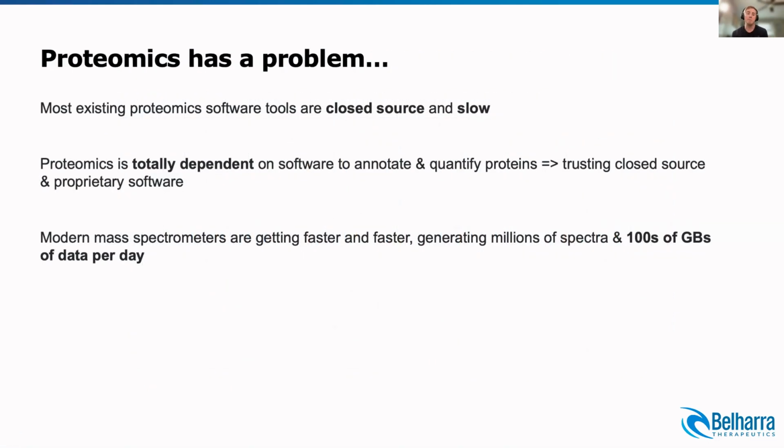But we also kind of have a problem. Most existing proteomics software tools are closed source and slow. And as you might expect based on the previous couple slides, proteomics is totally dependent on software to annotate and quantify proteins.